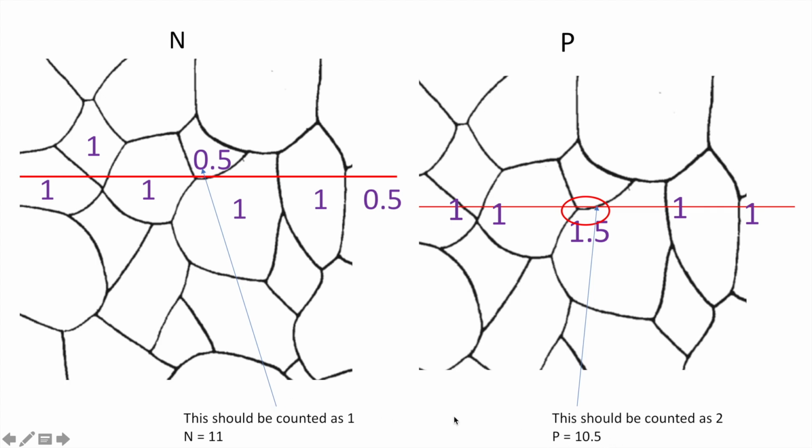Still, they're not equal. And actually, I've read a few reports online saying that when you come to this sort of situation, there can be a slight discrepancy between N and P, but the more you do, the greater the accuracy of results. So just stick with one method and just go with it. That's the message I think we should go with for the rest of this presentation.